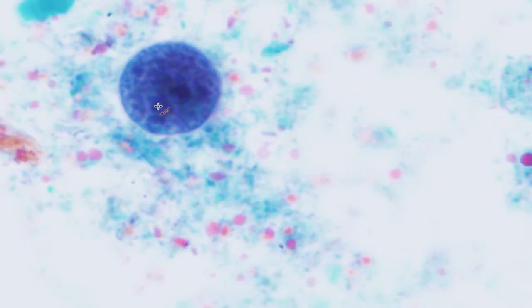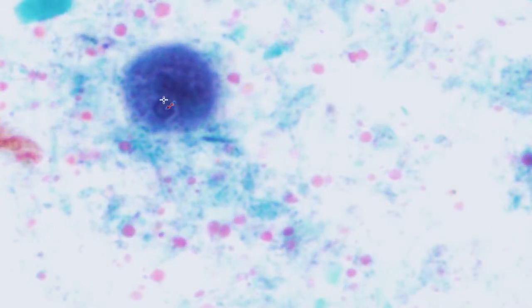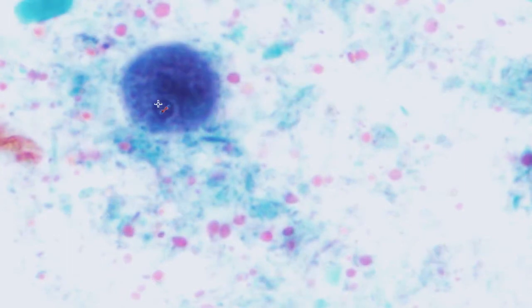karyosome. You can see it's off to one side of the nucleus, and this peripheral chromatin is not evenly distributed. It's kind of really massed around this pole of the nucleus, and then on this side there's far less peripheral chromatin. Let's have a look at some of the other nuclei. Eccentric karyosome, although quite evenly distributed peripheral chromatin on that one.